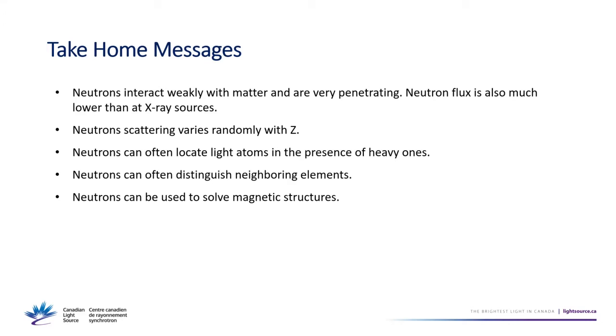Well, you mentioned that when you are changing the flight paths, you can have a better resolution or a better intensity, right? Yes. So which one is better, or does it depend on the application? Yeah, it depends on what you need. If you have a very complicated structure with a lot of overlapping peaks, then you need that high resolution. If you have a very simple structure that's going through some in-situ reaction very quickly, maybe the time is more important, and you can deal with having a little bit broader peaks. So it depends on the condition.